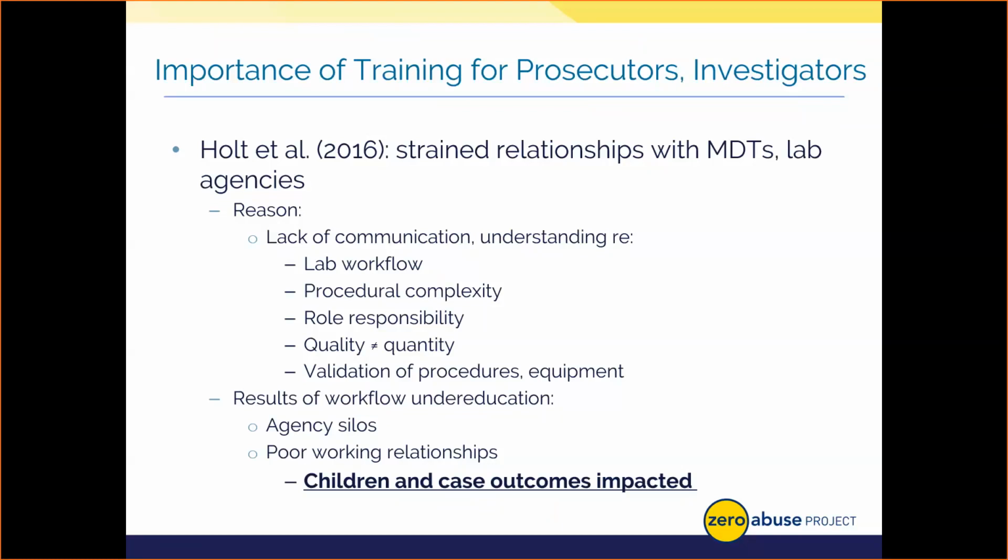Because prosecutors, investigators, and other MDT members are unaware of all the challenges to lab processing, and because we as lab personnel equally fail to make it clear, alongside failing to recognize just how much quality control and quality assurance goes into handling even one item of evidence, we often get a proverbial butting of heads. You think we should get items completed and analyzed and results out in a week or less. We also have training and procedural or equipment validations that we have to go through, all of which can take time away from getting your results.